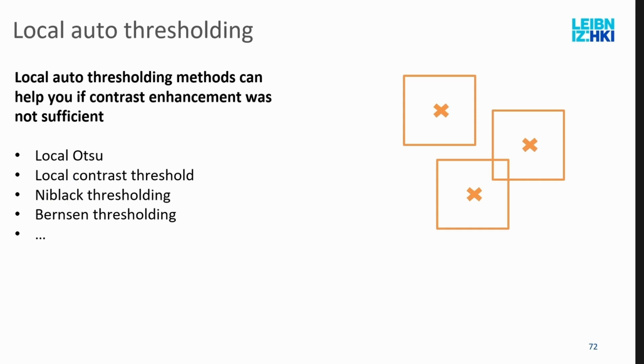And then we can take this and combine it with local windows, because there are also local auto thresholding methods that take a window and then apply for this singular pixel the threshold value that then decides if it's black or white. There are variants that you will find in ImageJ, local variants, like local Otsu, local something that uses contrast, and then algorithms that are specifically built for local auto thresholding that have some limitations in there, so it does not accidentally detect super dark images.